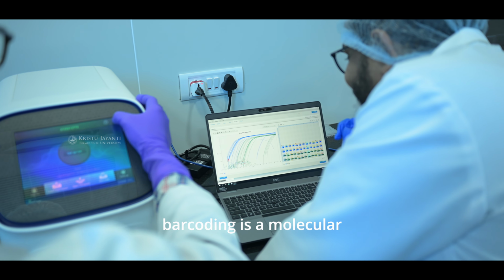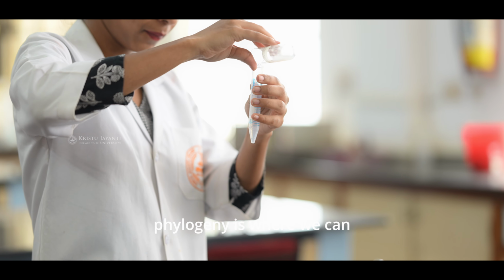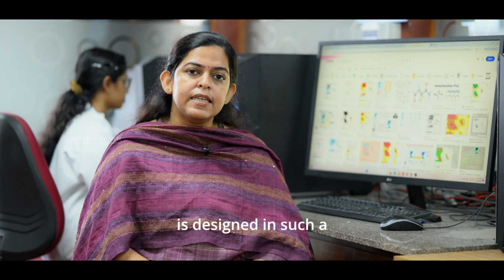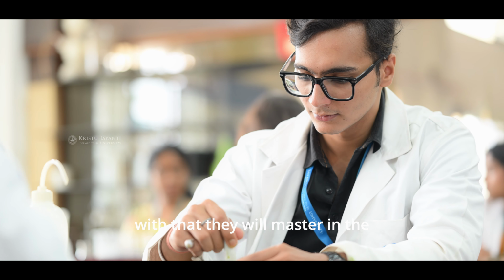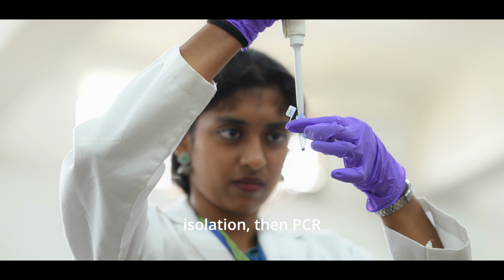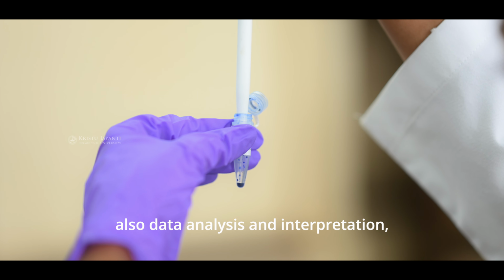DNA barcoding is a molecular method with which we can identify any living organism. And phylogeny is where we can understand the relationship between different organisms by constructing a phylogenetic tree or a family tree. So this internship is designed in such a way that the students will be able to understand DNA barcoding and molecular phylogeny. Along with that, they will master molecular biology techniques like DNA isolation, PCR amplification, primer designing, and also data analysis and interpretation, phylogenetic tree construction, etc.